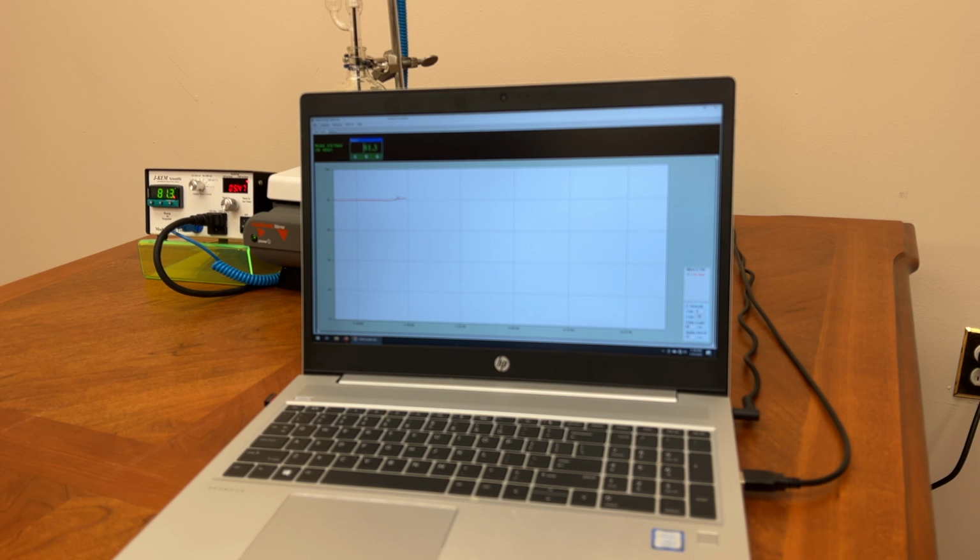But what that does is that masks the exotherm. But if you were able to plot the power going to that heater, what you would see, even if you had a flat line, is all of a sudden you would see that power was at a steady level and then it decreased and it came back up. And so by being able to data log the power delivered to the heater, you can monitor for an endotherm or an exotherm in your reaction. And also, as I said, the Chemnet Pro allows all data to be logged in a GMP compliant format.